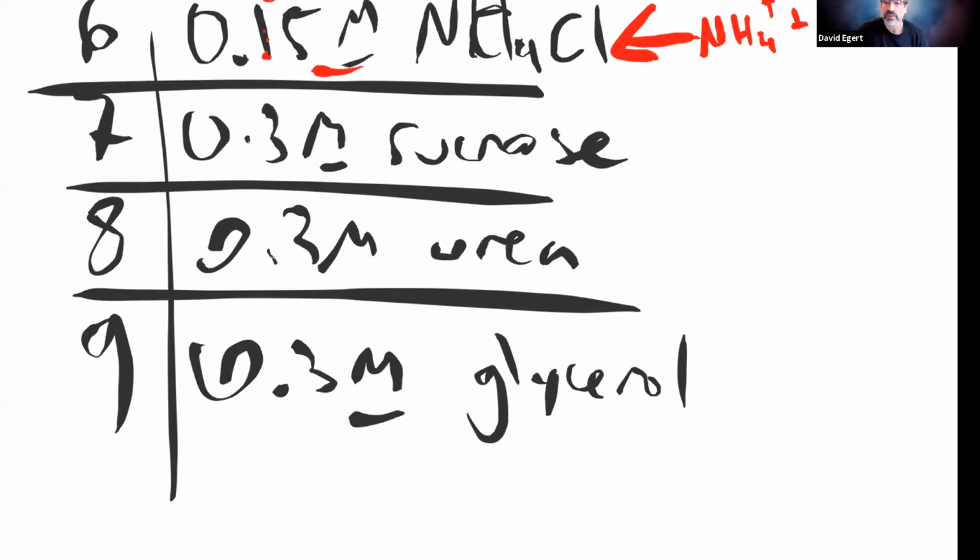On the first page of this lab manual, it was talking about chemical hemolysis. So in my hypothesis, I said that this solute will chemically destroy the plasma membrane. Right, so that's a possibility. So I will say this is a particularly interesting one. But I want to make sure when people come up with their hypothesis that you have some reason.